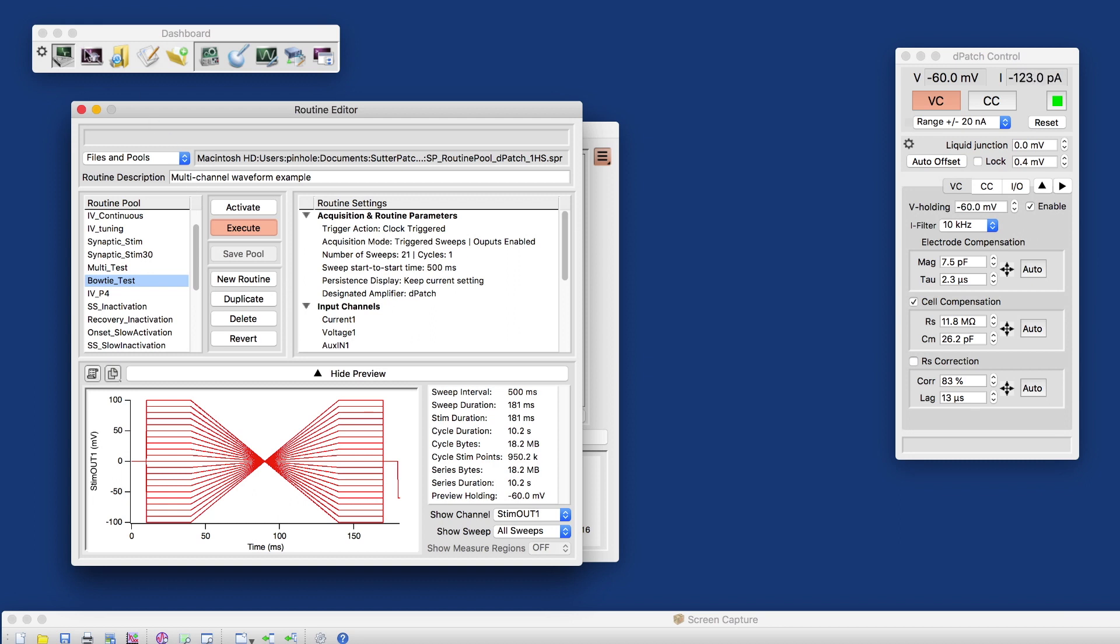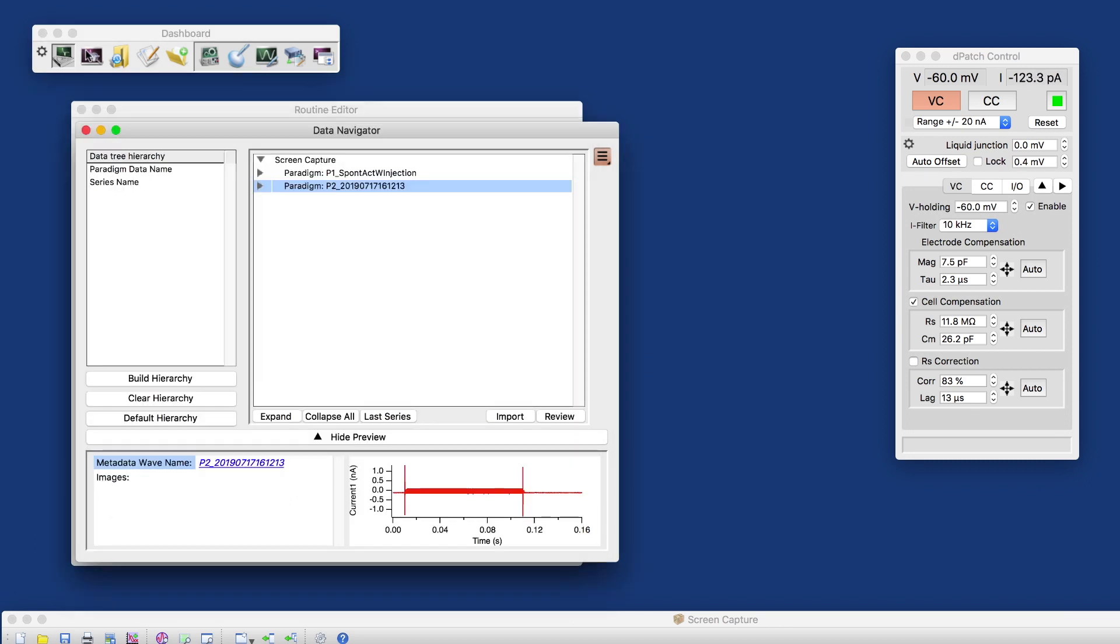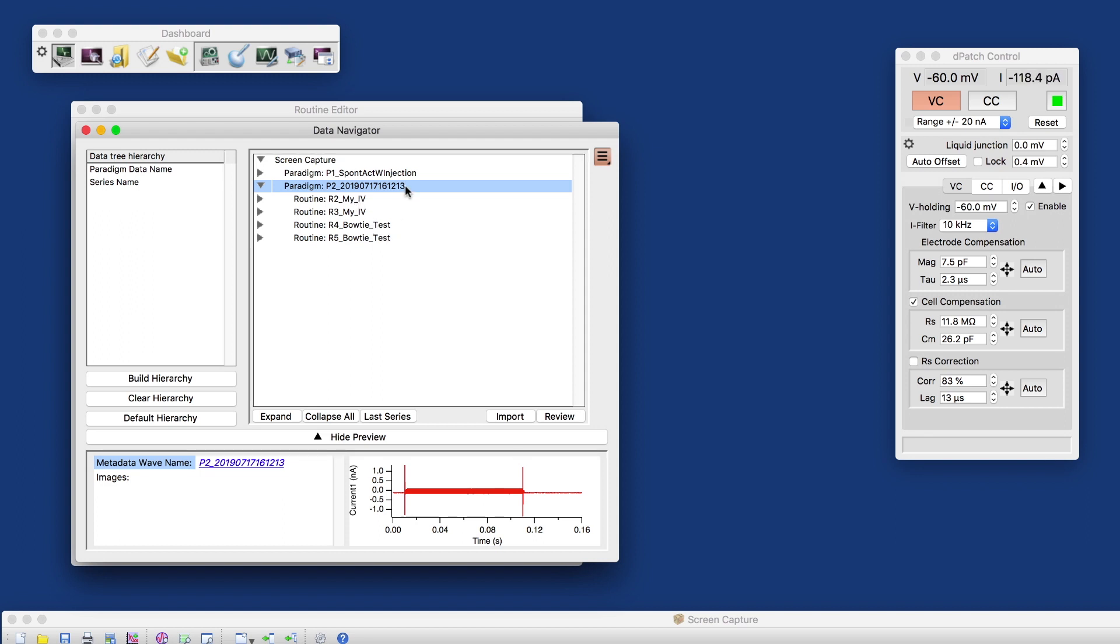And then we're going to go to the data navigator. And here, the paradigm that we just recorded includes four routine data sets, four series, two of the MyIV and two of the Bowtie test.